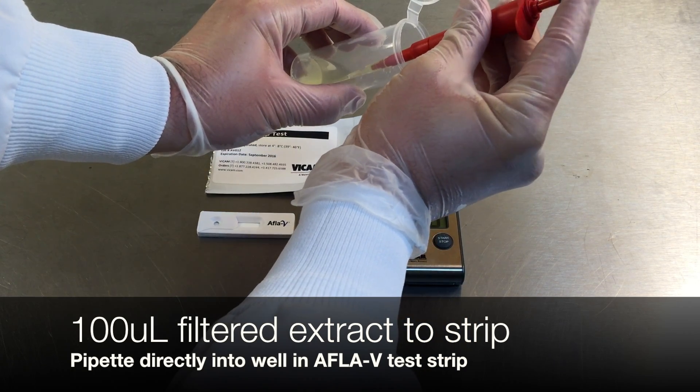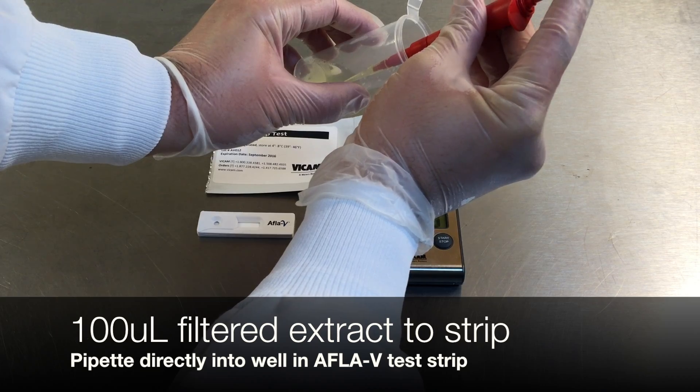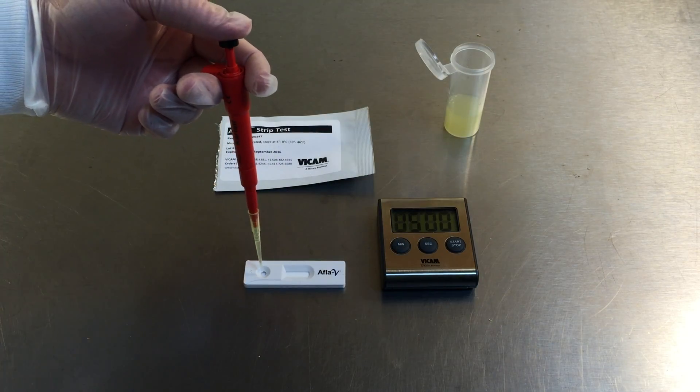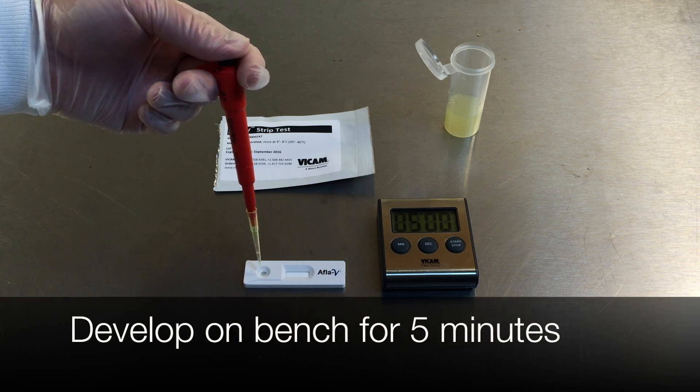Pipette 100 microliters of filtered extract to the well on the left of the Vicam Afla-V strip. Develop the strip on your bench for 5 minutes.